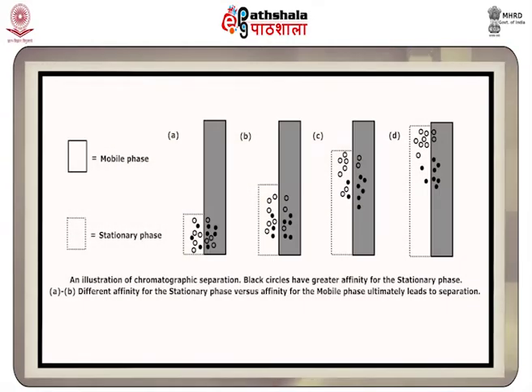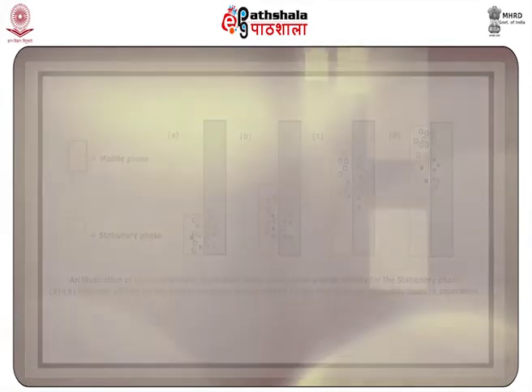Components having higher affinity towards the stationary phase will obviously get adsorbed sooner than those which have less affinity. Thus, the separation of various components of a mixture depends on their differential affinities towards the stationary phase.